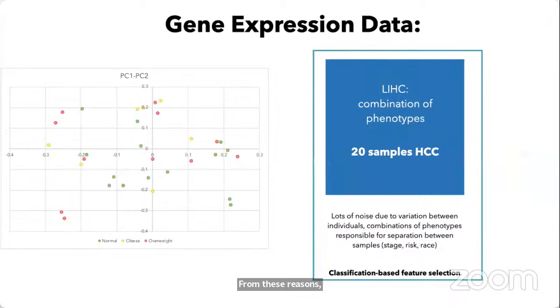We will take a subset of this data, focus on only 20 of the samples, and when we try to understand the patterns available within these 20 samples, we readily see that there is no pattern that one can identify from the principal component analysis as an exploratory data analysis.